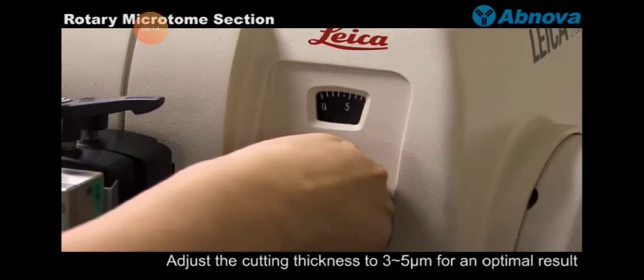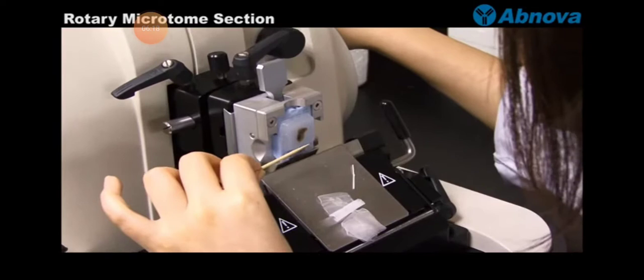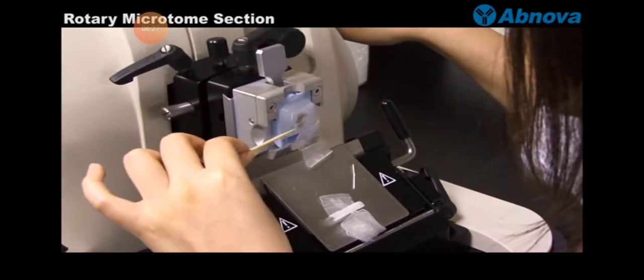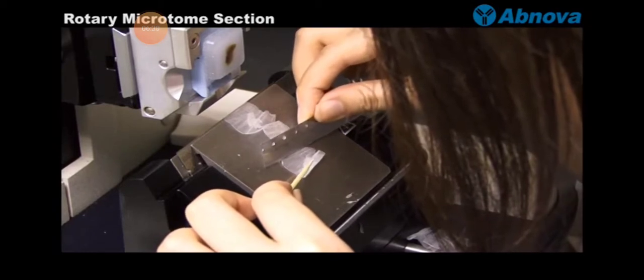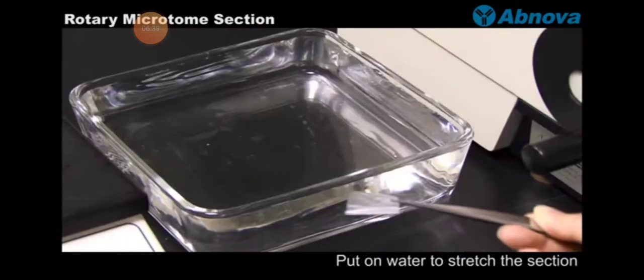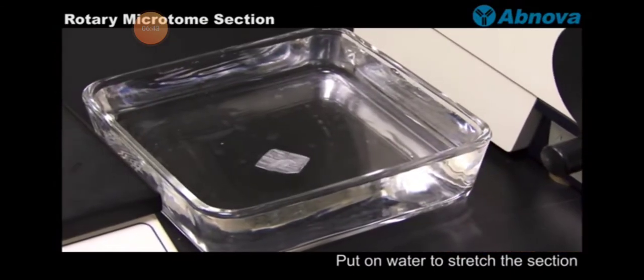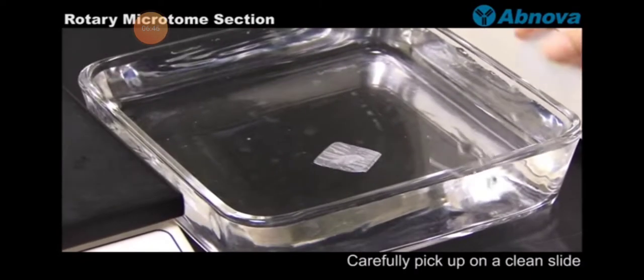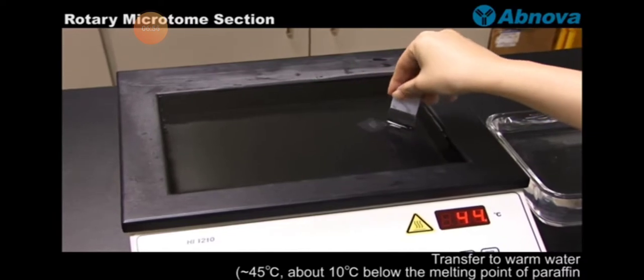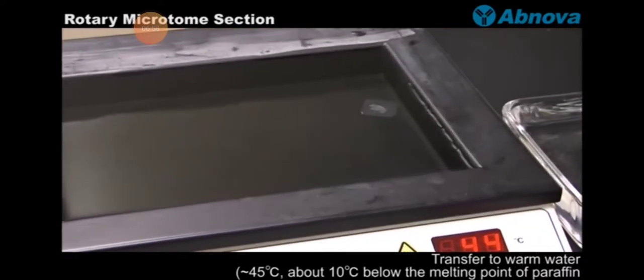A knurled button is turned to adjust the thickness. This is a section which is containing the specimen.